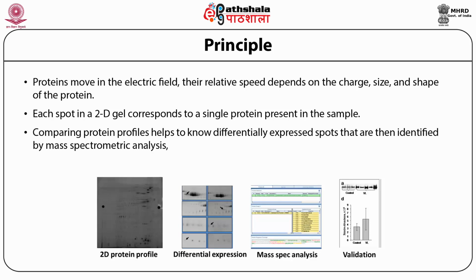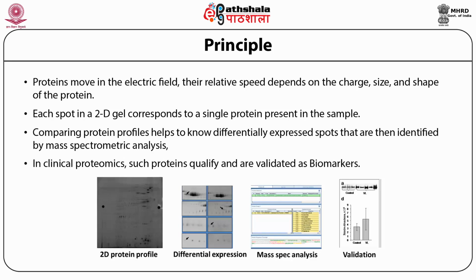Having identified the sample, we then go for a validation because it's a population based study, and the validation could include experiments like Western blot, ELISA, immunohistochemistry, and cDNA expression profile. This way, we are in a position to identify potential novel biomarkers or drug targets.